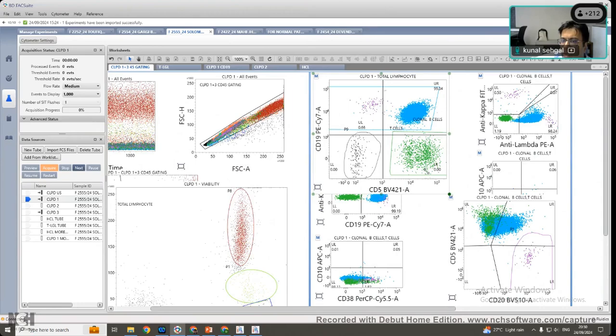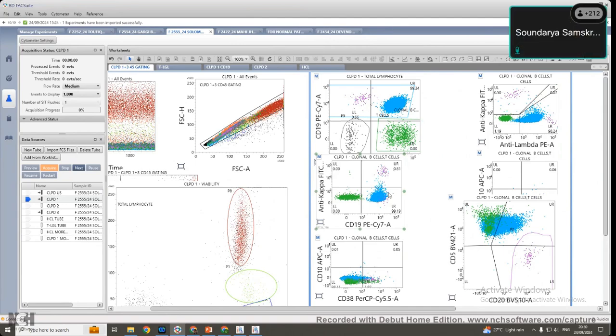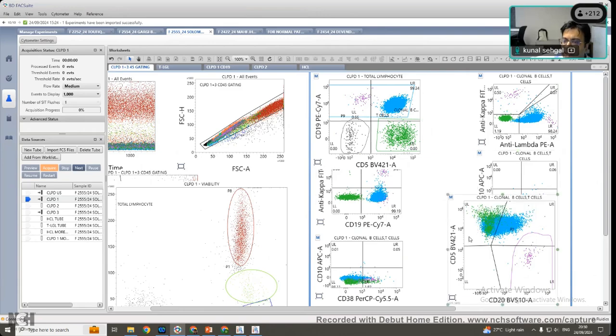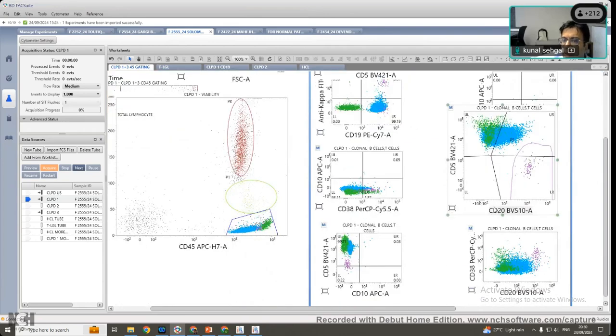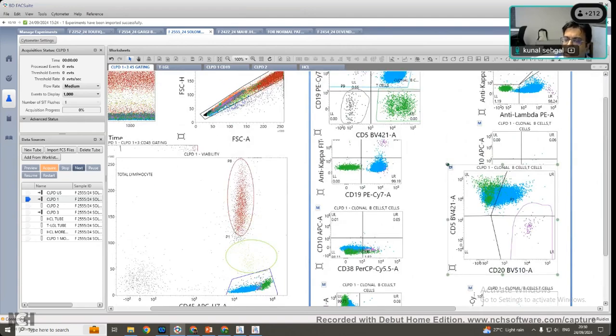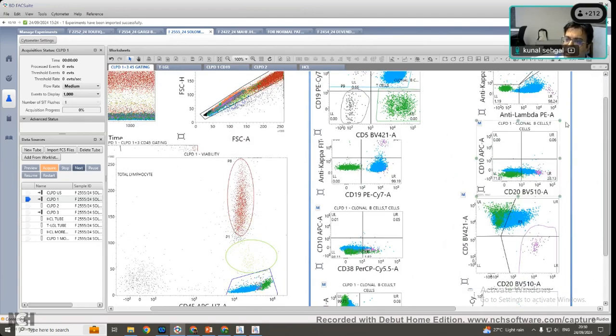What do you think we are dealing with, leukemia or lymphoma? First thing, CLPD or acute leukemia? CLPD. CLPD, mature B lymphocyte showing light chain restriction. Now, can we subtype the CLPD? Do you need any more markers? Do you know any different subtypes of lymphomas in peripheral blood? Any one of your students? Different types of CLPDs.